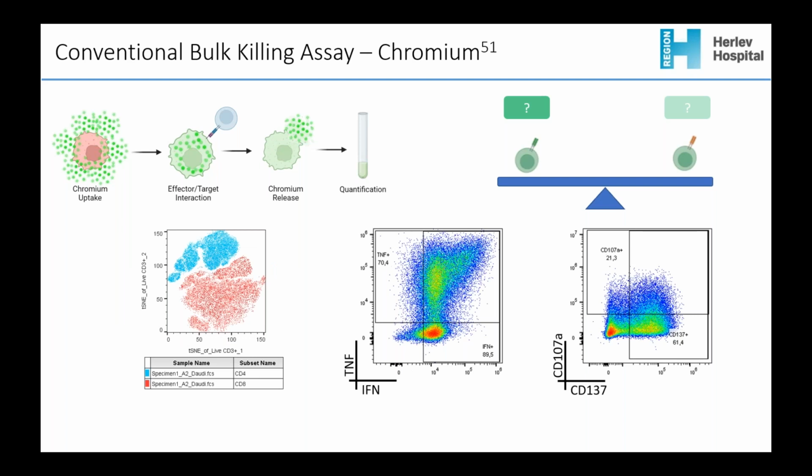And this is because these cells are different. There's a lot of heterogeneity in this population of cells that is 100% CAR positive. If we look, there are some CD4 cells, there are some CD8 cells. If we look at cytokine production, a lot of them are double positive for producing cytotoxic cytokines, but some of them are single positive. And the same is true for these activation markers.